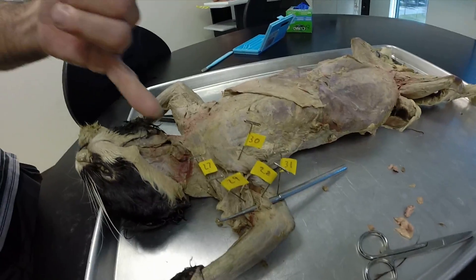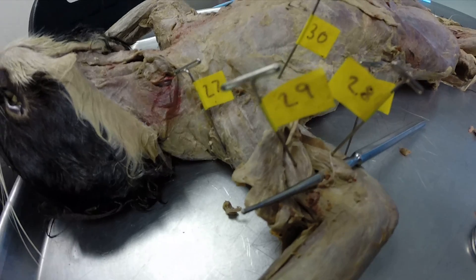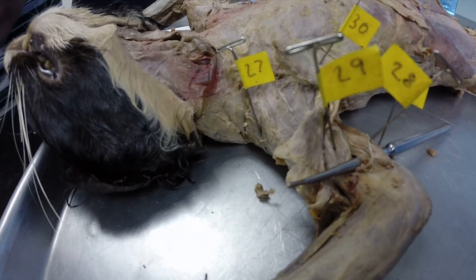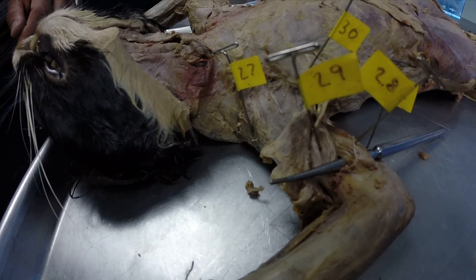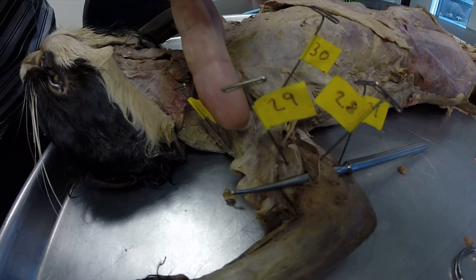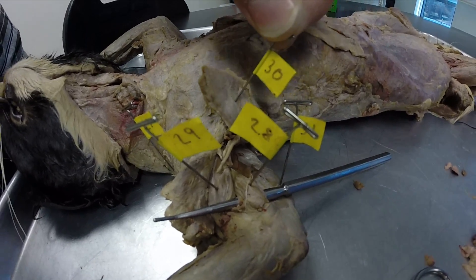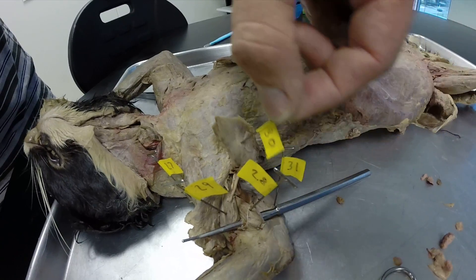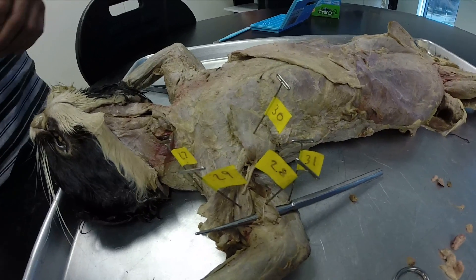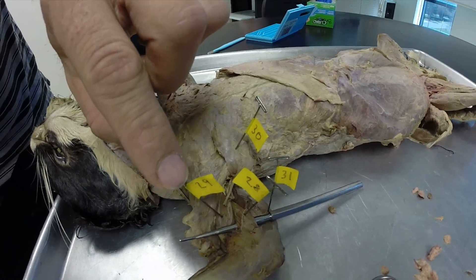These are pretty good ones. Number 27 looks like it's pointing to the muscle on the anterior side of the arm, so that would be the clavodeltoid. You can kind of see the pectoantebrachialis running right posterior to it. This muscle is reflexed back out of the way but would normally cover it. Number 30 right there — that's your epitrochlearis.